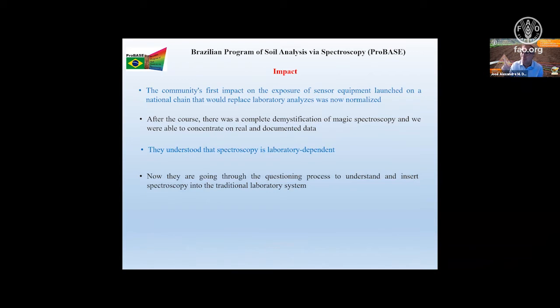They know that spectroscopy is good and it functions, but they want to see the limitations and how to do it. So now they are questioning all around how to make it, because they are seeking it. They are questioning everybody, what's happened now, how can I do this in my laboratory? So we are in the questioning part. And more, the regional soil quality regulators on wet soil laboratories are inserting spectroscopy in their discipline.